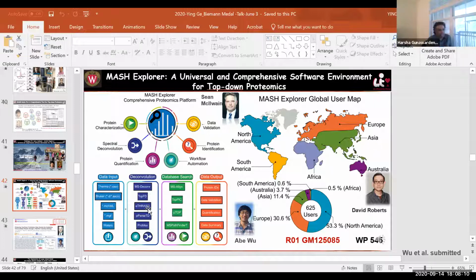Yeah, definitely. I'm going to take a look at that paper. But also, in the list of algorithms that you had, MaxEnt 1 or 3, or the parsimonious algorithm that's been written by Protein Metrics, are very, very popular in pharma, especially for antibody characterization. Which one, sorry? MaxEnt 1, maximum entropy. Oh, the maximum entropy, yes.